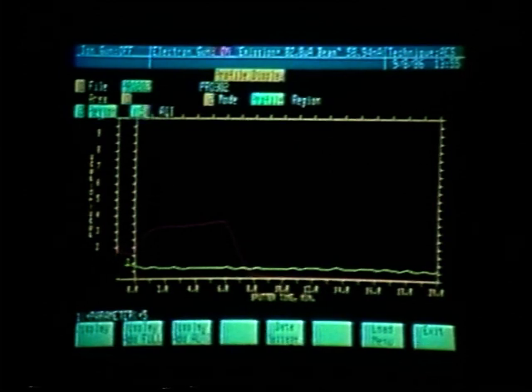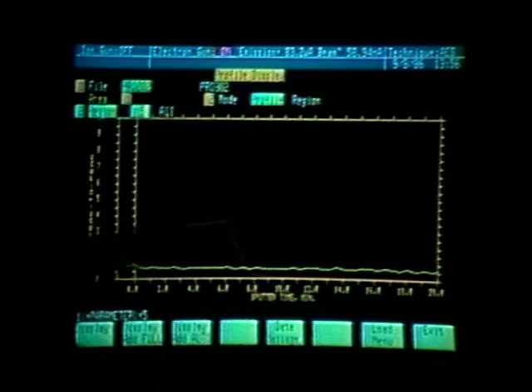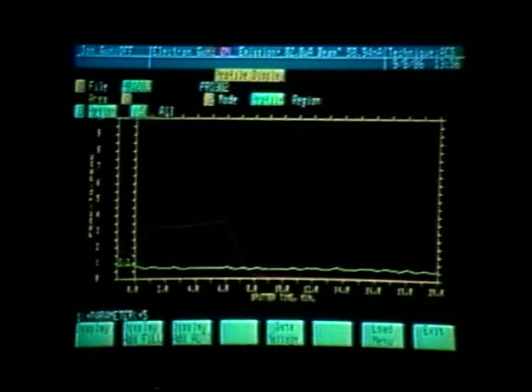What we would like to do is look at the oxygen peak at 0 minutes, which is cycle number 2. We acquired the data sputtering every half minute. Therefore, at 4 minutes, that would be 8 cycles from 0 plus our 2 pre-sputter cycles. So cycle number 10 would be the oxygen peak at 4 minutes. What I would like to do is look at the region and evaluate that data and determine whether oxygen is indeed there or whether we have a peak overlap with the chromium.